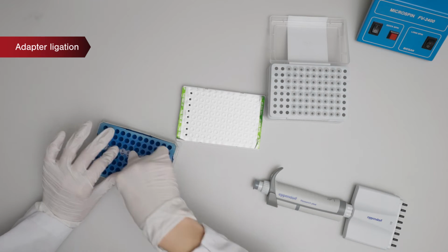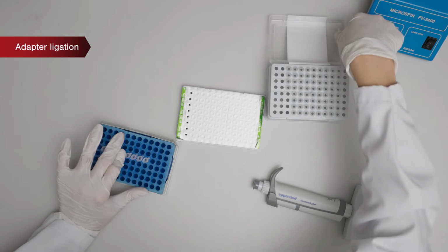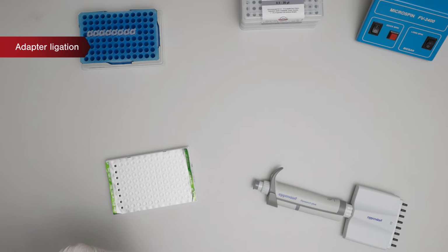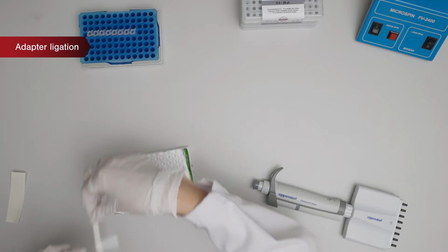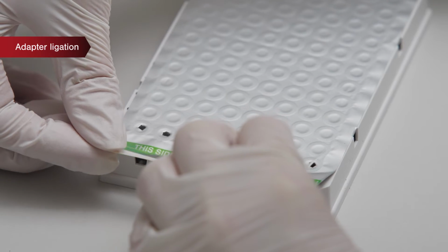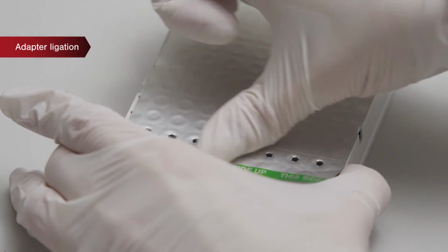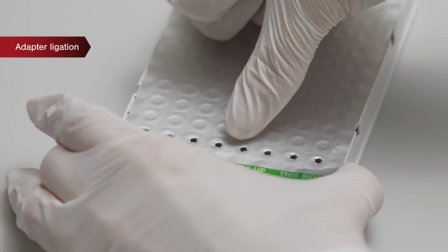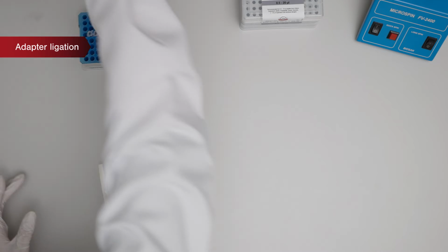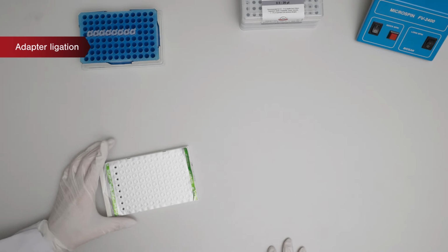During this step, a ligase enzyme covalently links the adapter and DNA fragment. The adapter contains a reference code, which allows identifying each fragment from the same sample. Adapters allow multiple samples to be sequenced together on the same flow cell. The adapter also indicates where the sequencing primer should bind, and where sequencing should begin.